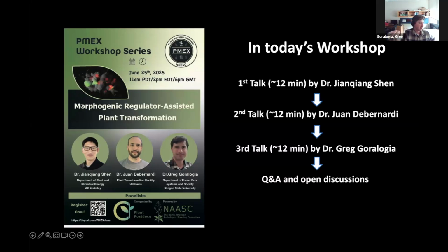So if you're in a dicot, I would encourage you to try it out. Most of the old school vectors are going to be kanamycin or Basta, and especially with morphogens, we found that spec is a better one to use in dicots.